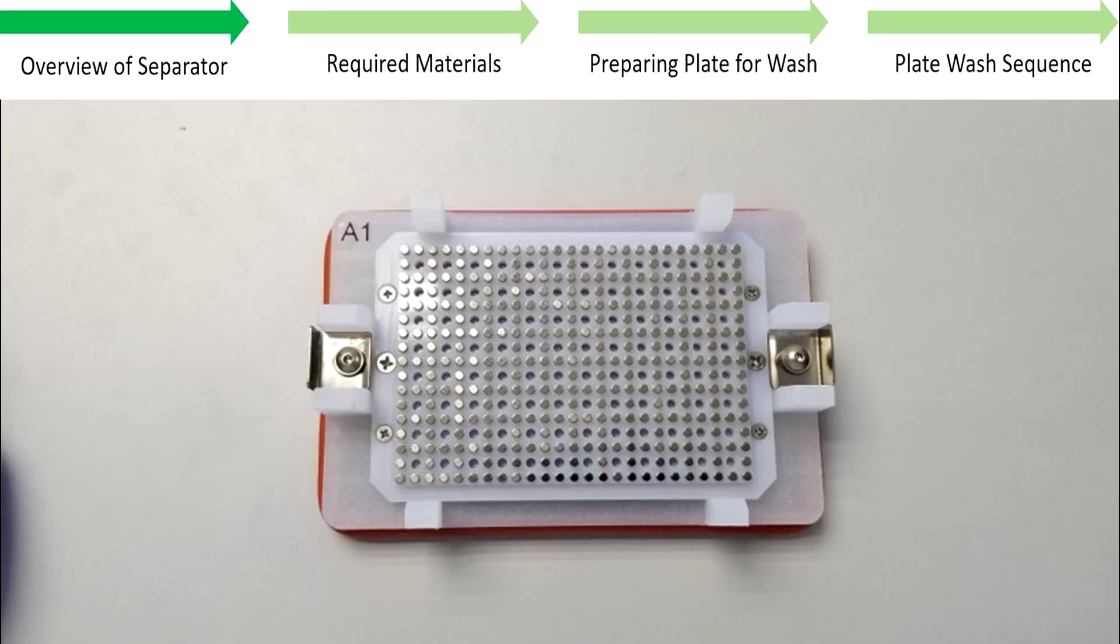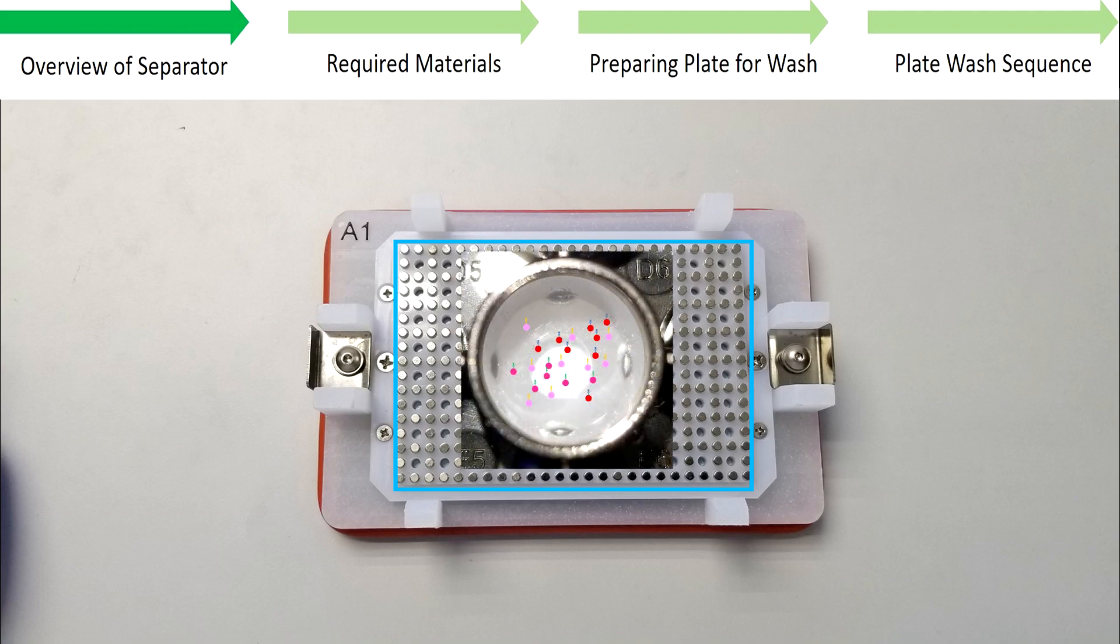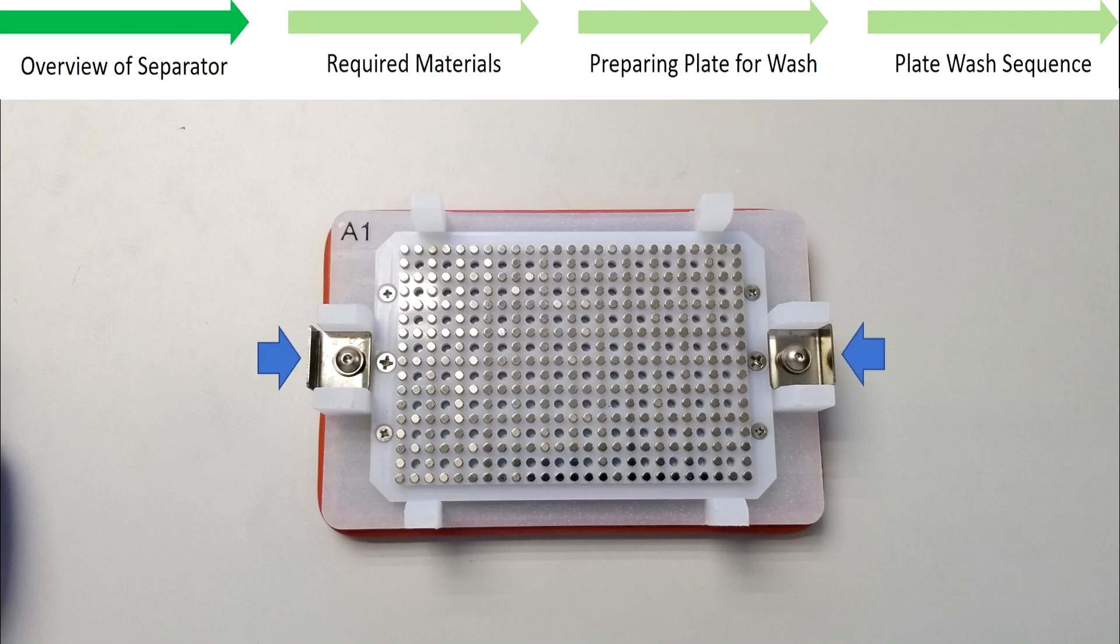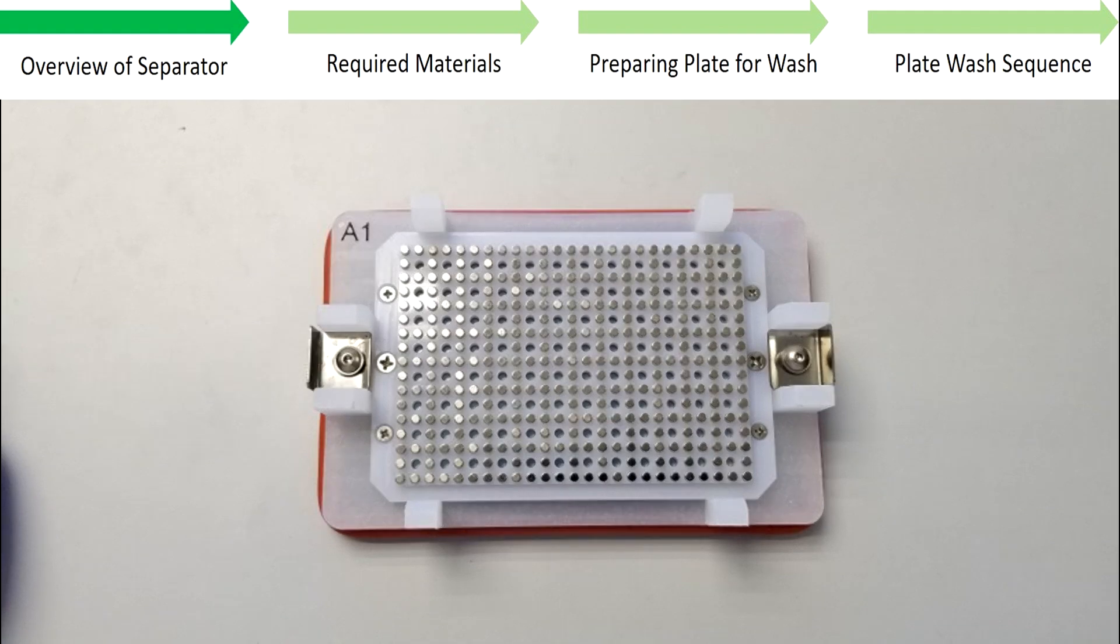Here is a top view of the plate separator. There is an array of magnetic pins arranged throughout the surface of the device where the plate would sit. They enable washing by attracting beads from suspension to the Mylar well bottom, holding them in place while liquid is decanted from the wells. Two metal latches enable secure plate fit, while an orientation guide ensures correct plate positioning. This device is pre-optimized to fit MillPlex assay plates and does not require further adjustments.